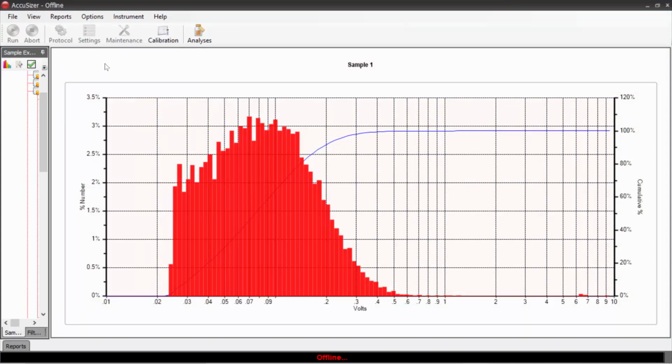So we can use these to change the chart preference. Perhaps we want to change these to match corporate colors. Or maybe if I'm always measuring sample A and sample B, but they're often similar, I could have a different color code for A versus B and would help us differentiate which result we are viewing.